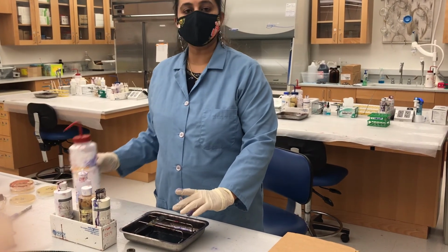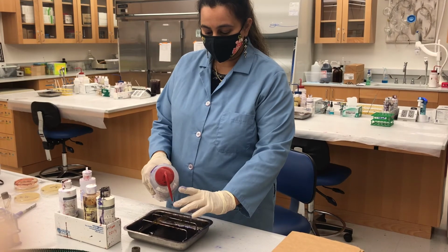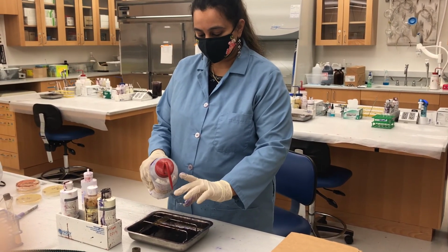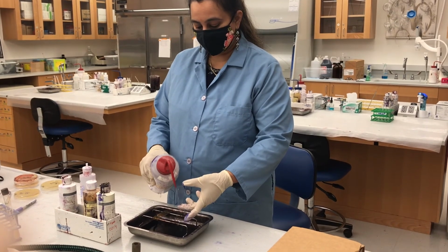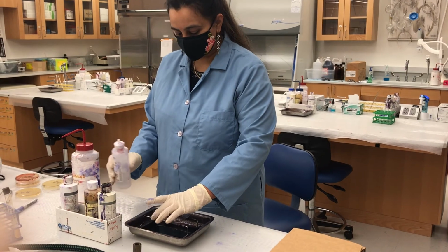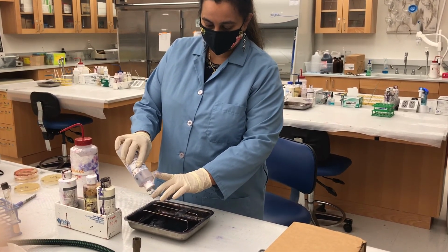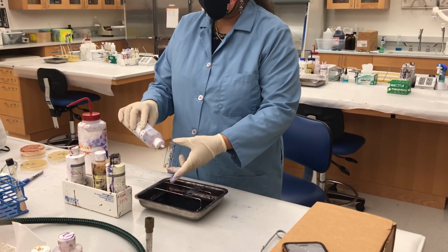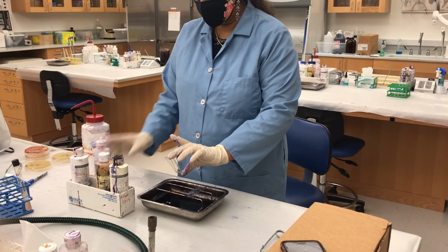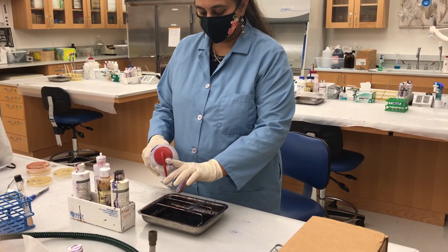Okay, my 8 seconds are done, and I am stopping the action of the decolorizer by washing it with water. I'm adding the decolorizer to the liquid culture smear also, just for 8 seconds, and stopping the action by washing it with water.